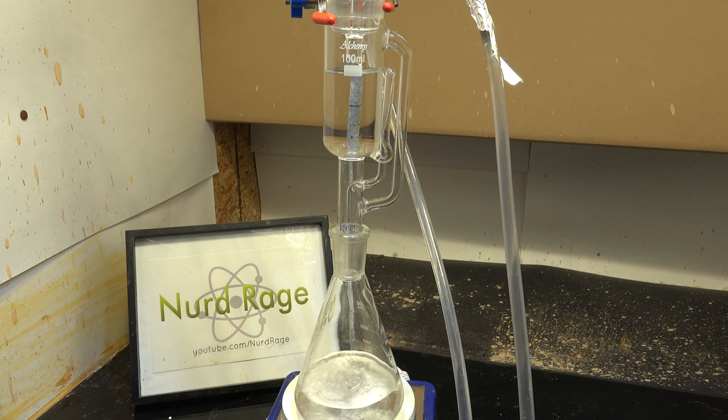Greetings, fellow nerds. In this video, we're going to examine a specialized piece of lab equipment called a Soxhlet Extractor.